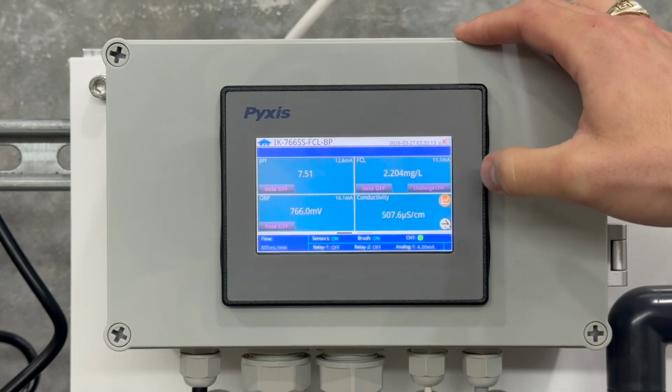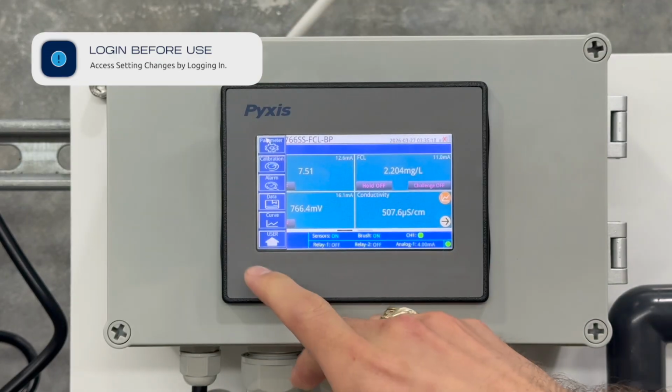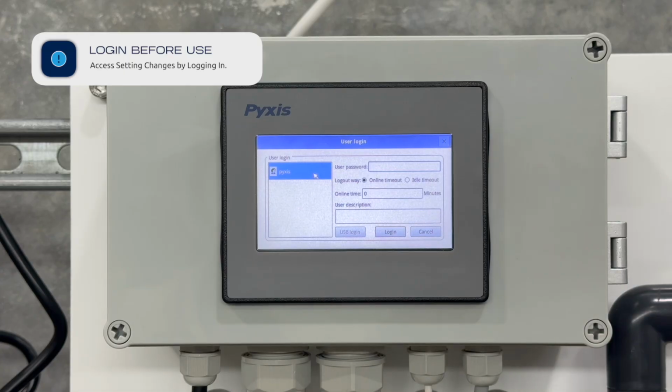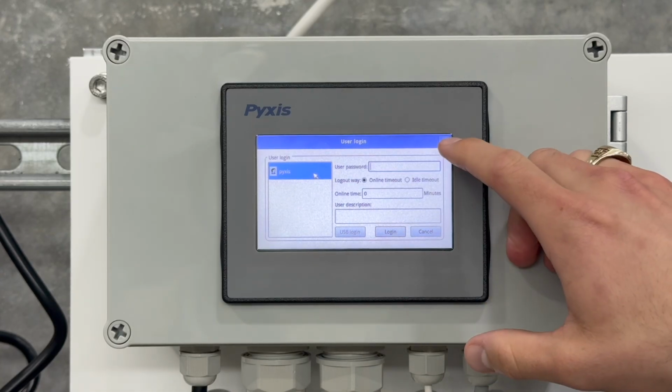Before doing anything, you're going to want to log in. To do this, hit the home button in the top left, user at the bottom, log in, type in the password provided in the Pyxis user manual, and hit the login button.